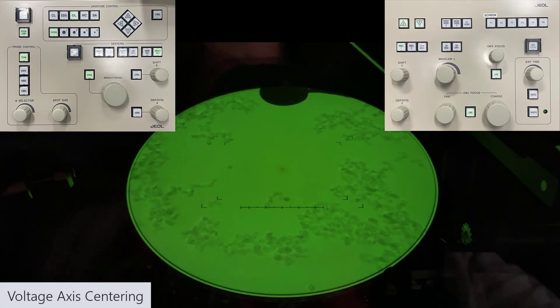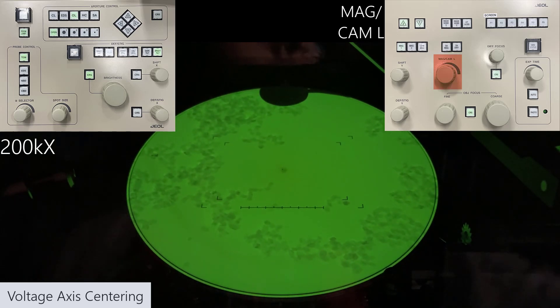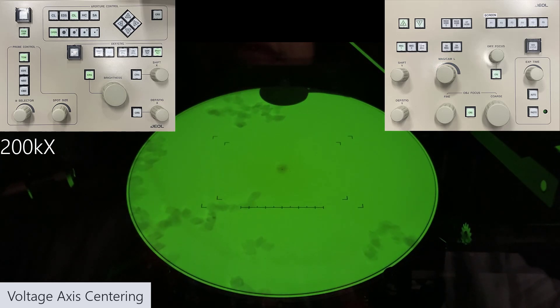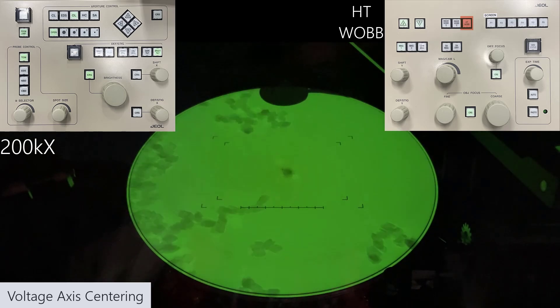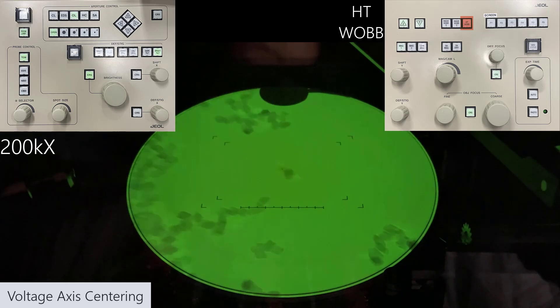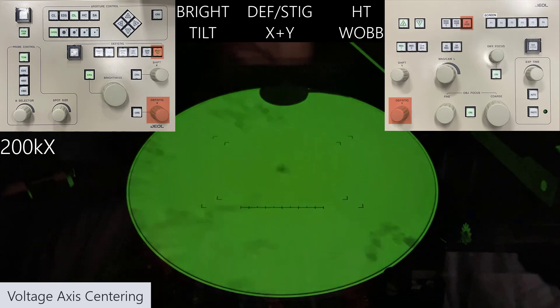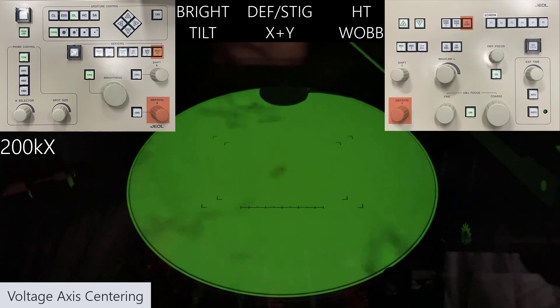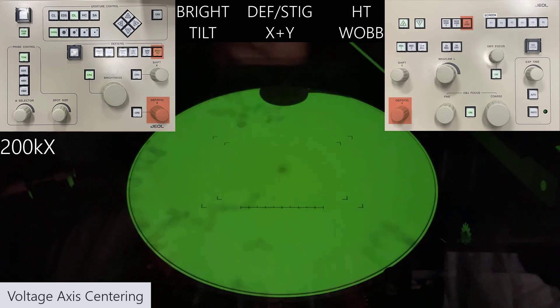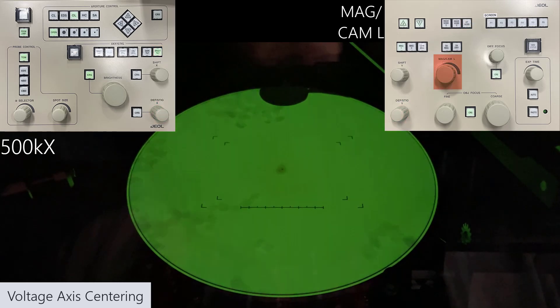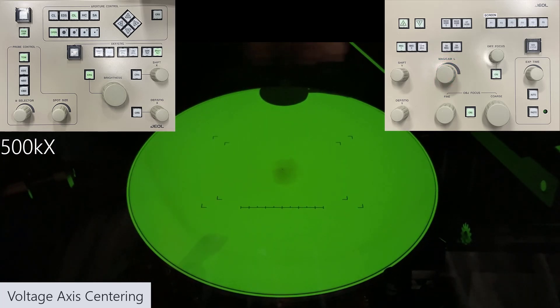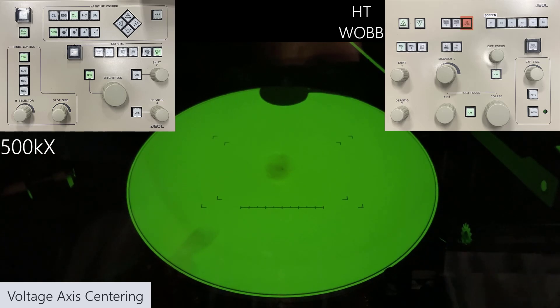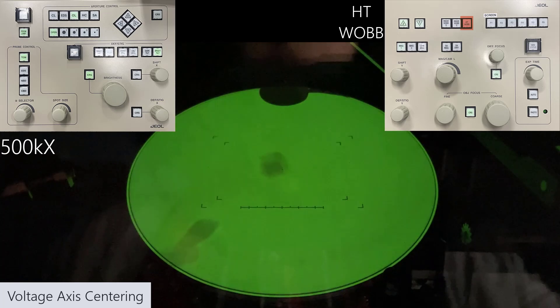Next is the voltage axis centering. For this we want some kind of circular material — it could be a particle like what we have here, or it could be a hole. I'm going to increase the mag to 200,000 times, center the particle, and then select the HT wobb button. We want the wobbling from upper left to lower right to change to more of a breathing about the center. We do that by selecting the bright tilt button and using our deflector stigmator X and Y knobs, changing these one at a time to avoid confusion.